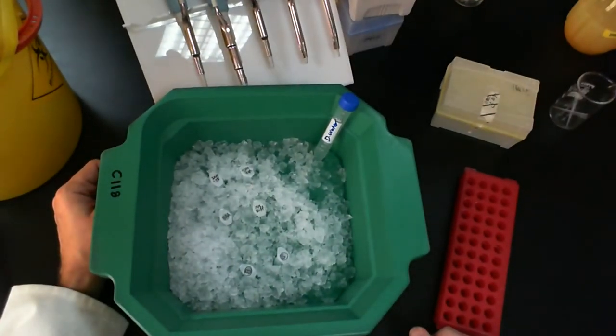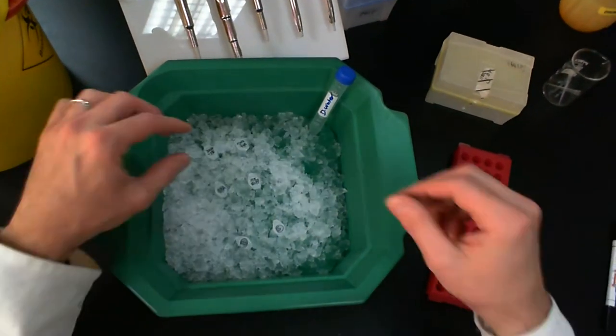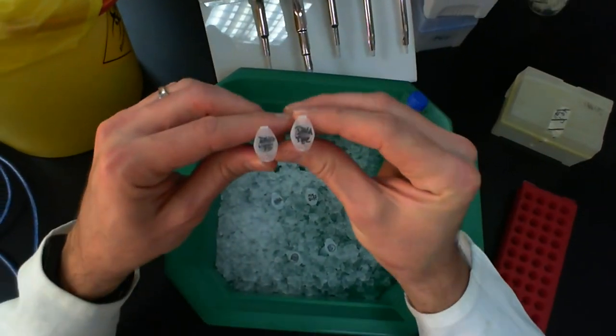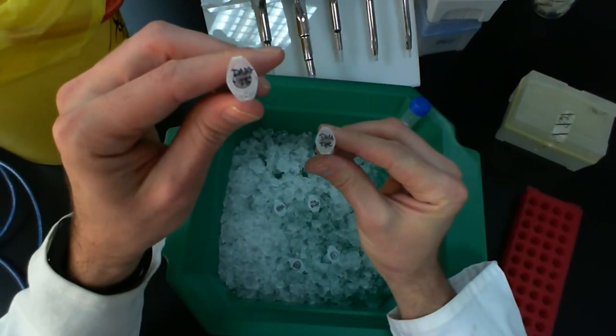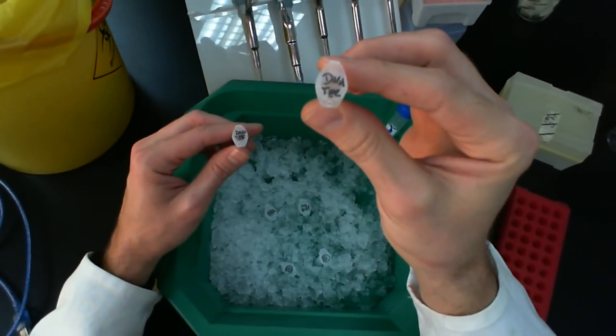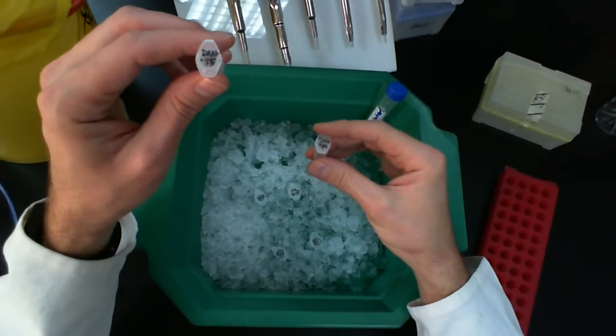So here we are, about to set up the digests. What you will have in your ice bucket are your samples of DNA, or you may have to put those there yourself. So I have my DNA with TE and DNA with TER. That's the one that was treated with RNase, so it should have no RNA in it. This one might have RNA, at least probably does.